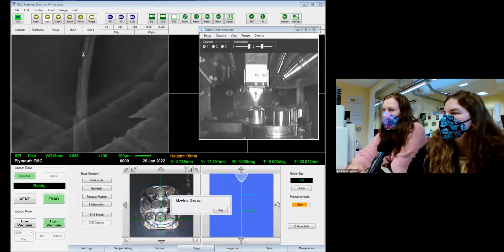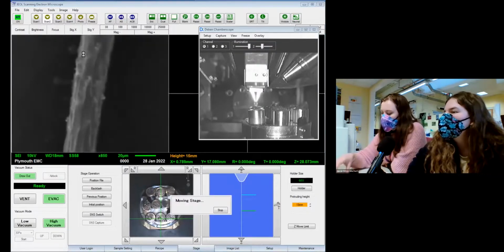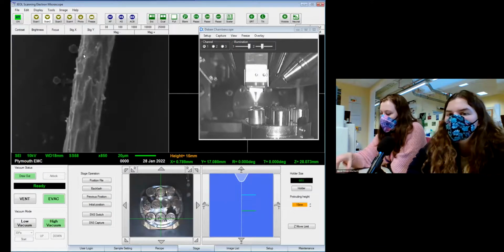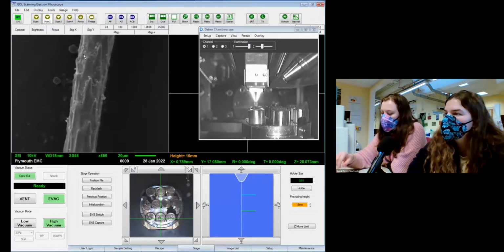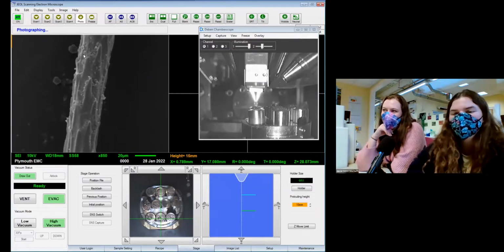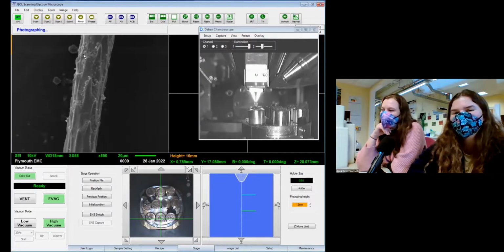So I'm assuming it's like an inner coat, outer coat thing. Yeah, that looks like the thin one. So maybe German Shepherds are more wolf-like than Border Collies are. Maybe. Who would have thought? I wouldn't say this German Shepherd is wolf-like.